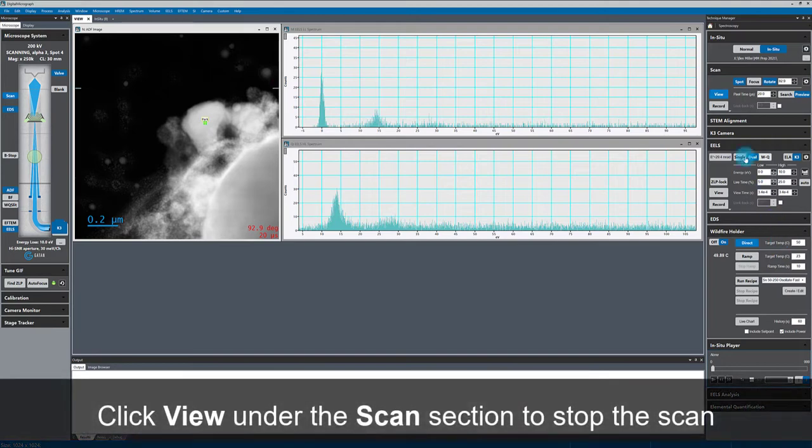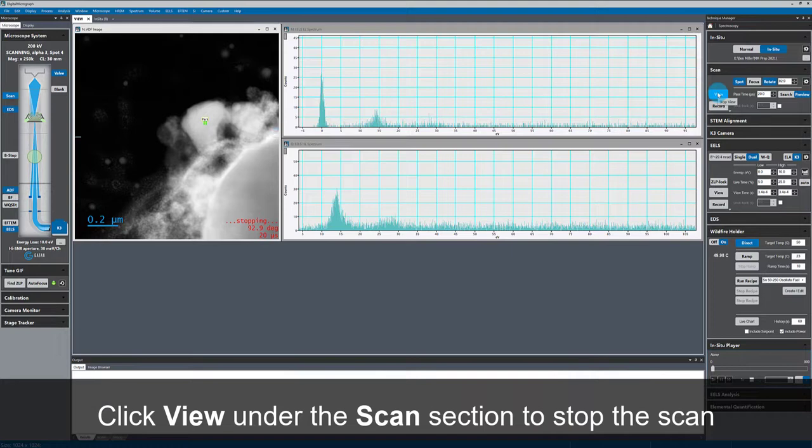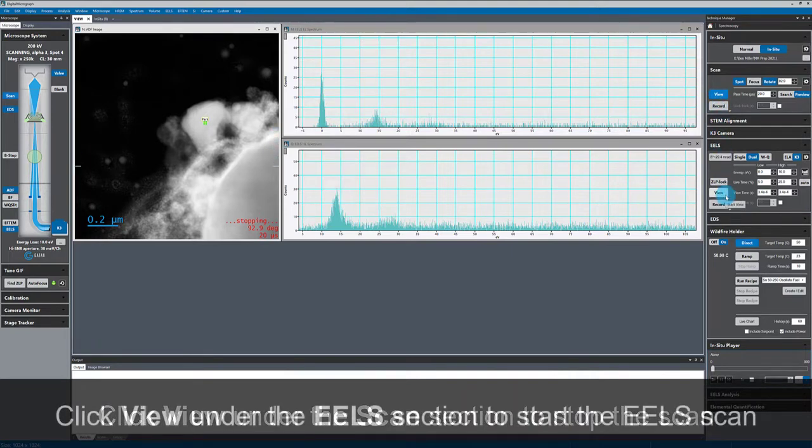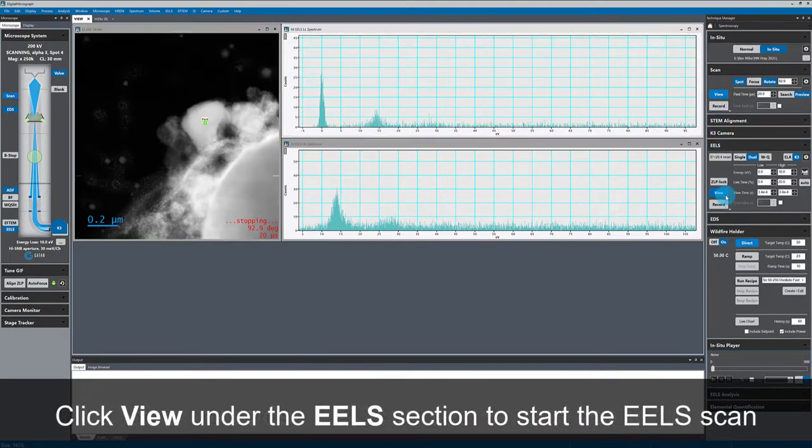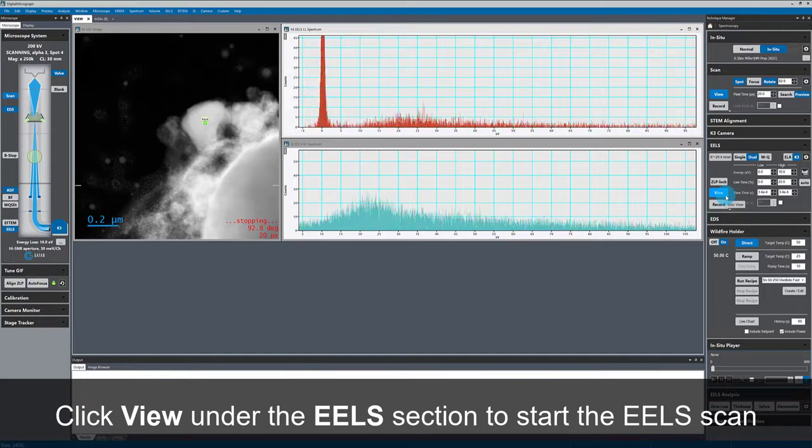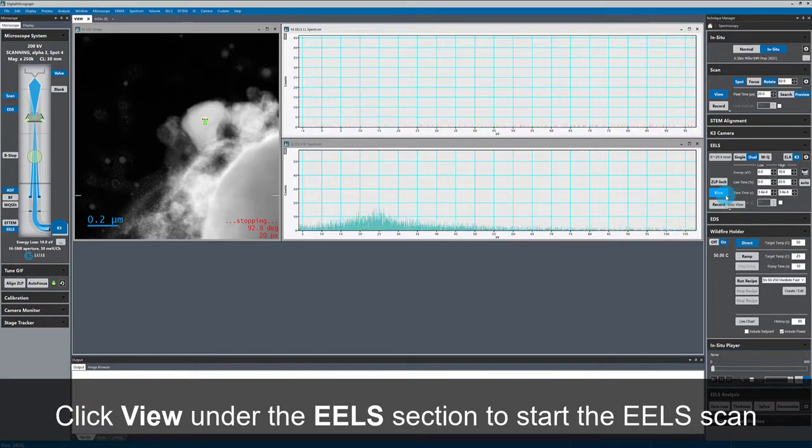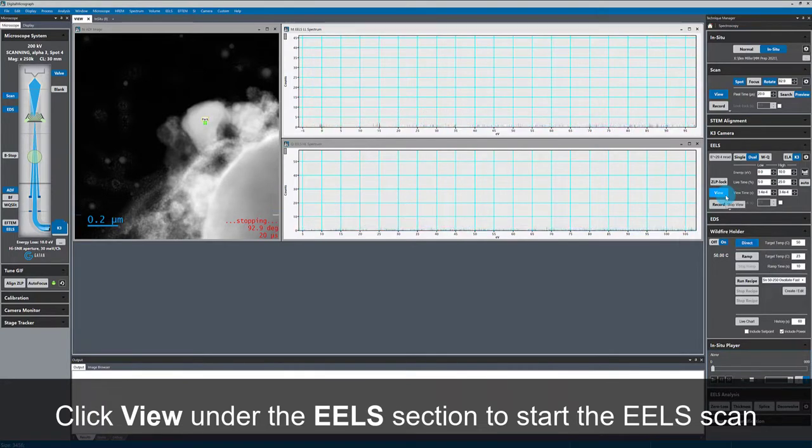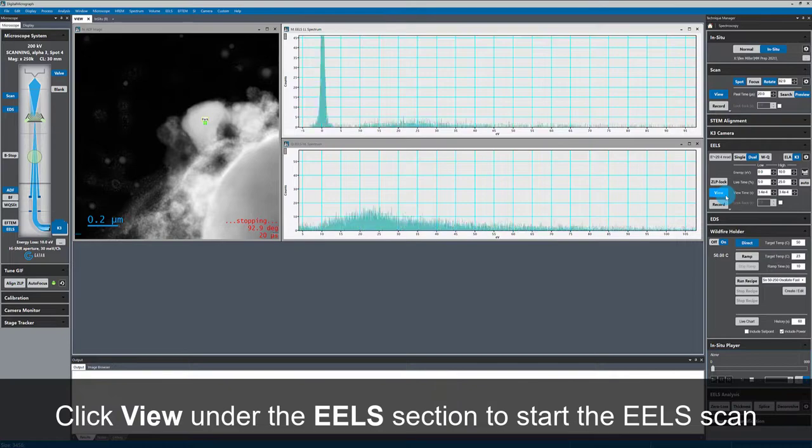I've also started the STEM scan. Now I'll pause that scan and start the live EELS view. When the beam is scanning, my EELS data comes from wherever the beam was at the moment.